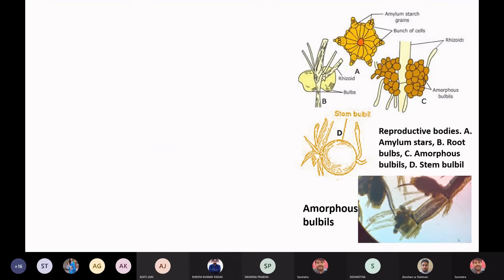I will say one more thing. We showed you only the preparation of one slide, that is stained with acetocarmine, but we have also prepared slides with a stain of iodine. हमने iodine का आपको आंसर पता है, because it contains starch, that's why we are using iodine. But why acetocarmine? Just think over it.